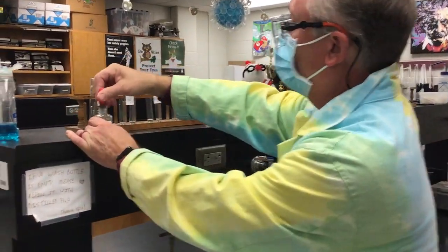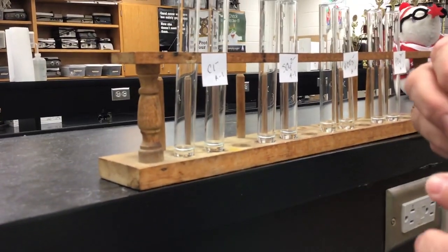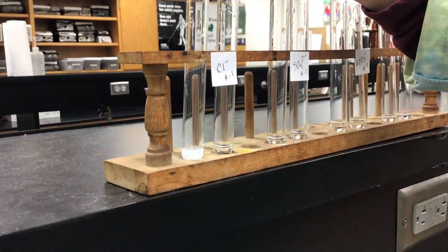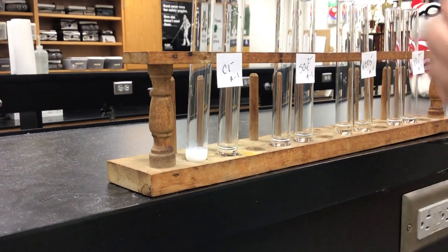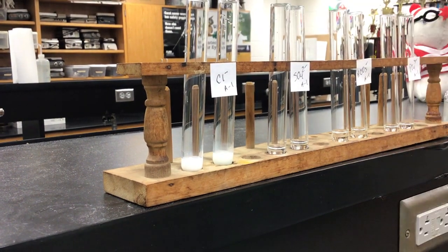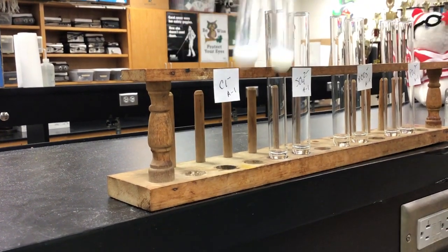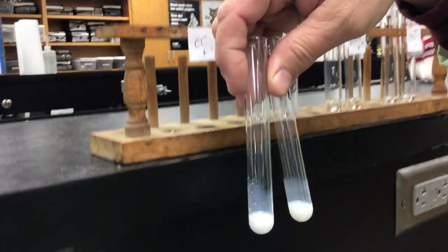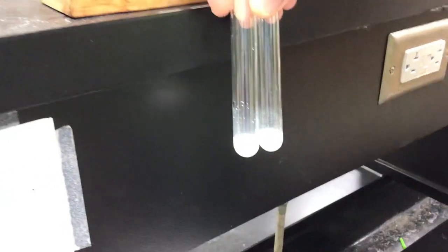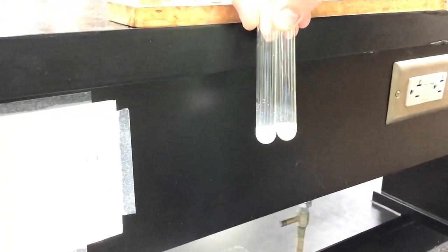So here we go. I'm going to put into solution the silver nitrate, or silver ions, and see what we get as a result. So 5 drops of silver nitrate, and 5 drops of silver nitrate. And you are looking for them to be the same. Now you've got to be careful with this though. I'm going to tap them and see. If you look at the colors, tell us what you think, if you think they are exactly the same or not. And we may even come back to them towards the end, and look at them again and see if they changed a little bit over time.